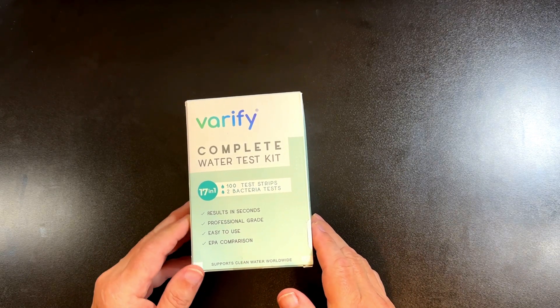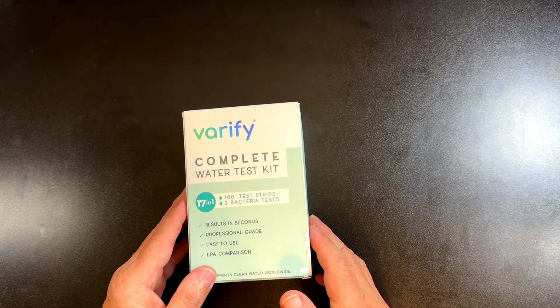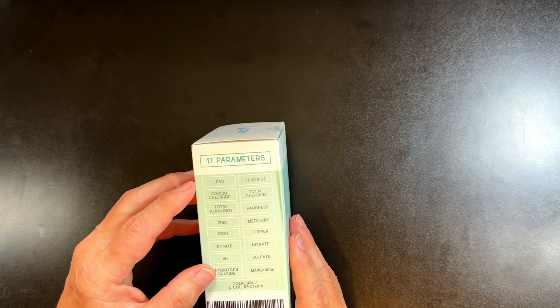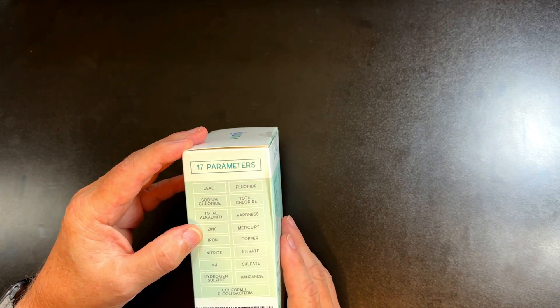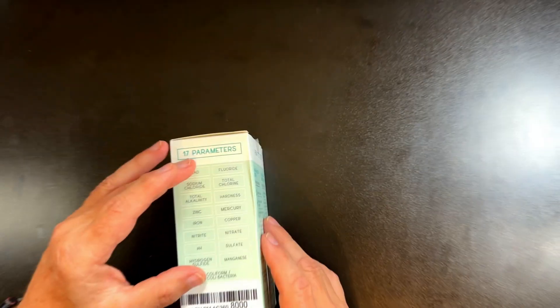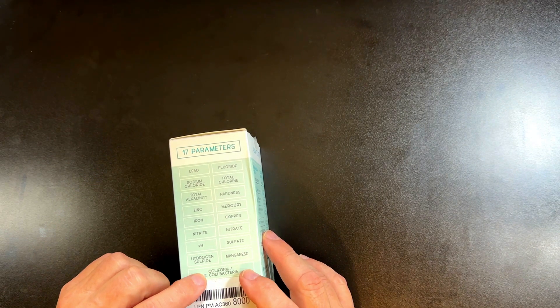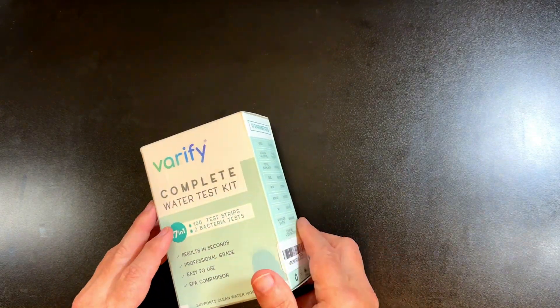This is the Verify Complete Water Test Kit. It's got 100 test strips, so you can test 100 times for the different parameters: lead, fluoride, sodium chloride, total alkalinity, zinc, iron, nitrate, pH, hydrogen sulfide, manganese, sulfate, copper, mercury, hardness — 16 different chemicals you might find in your water, plus the 17th is bacteria: coliform and E. coli bacteria.